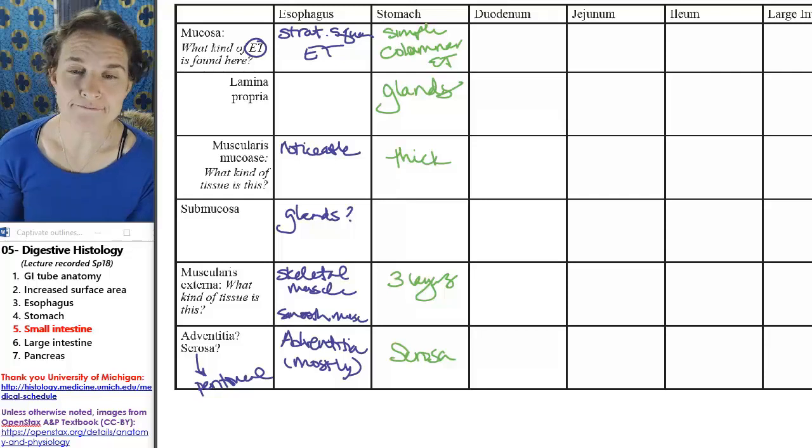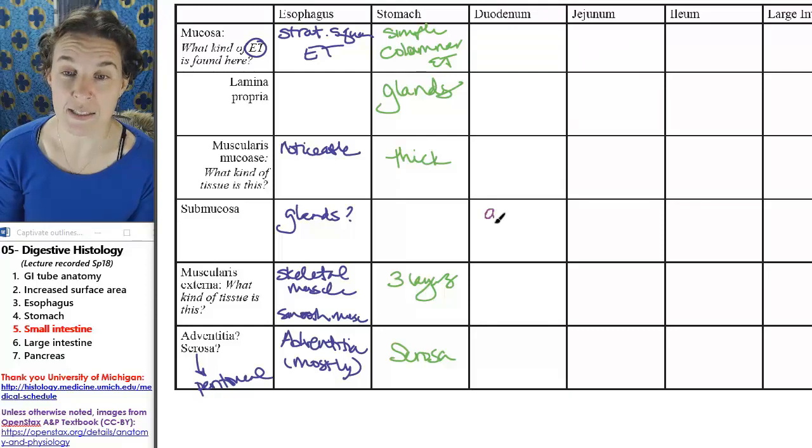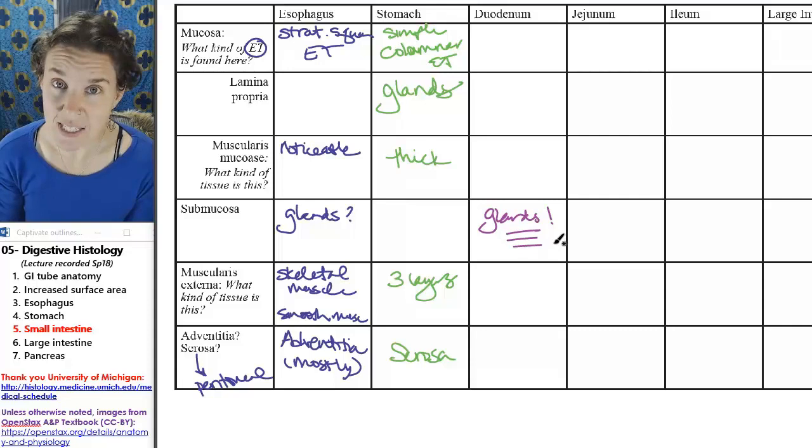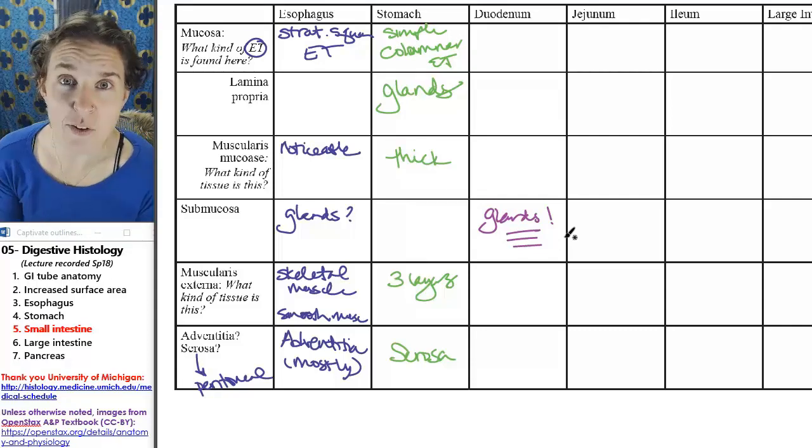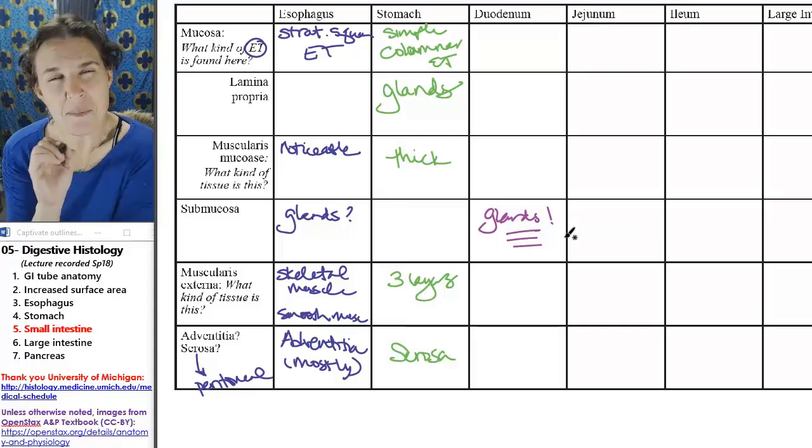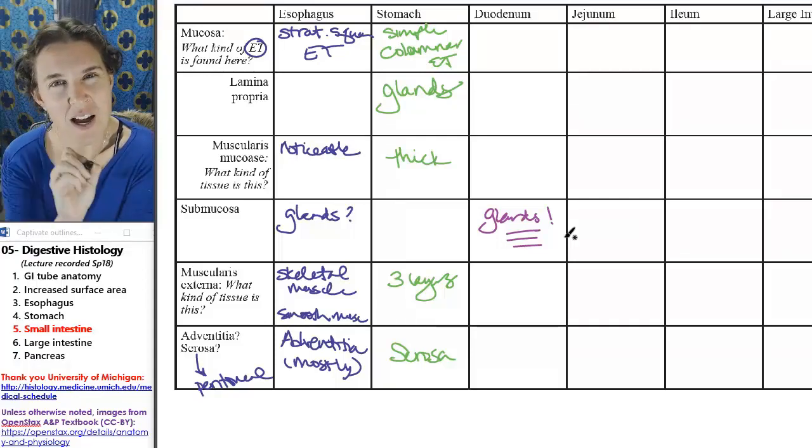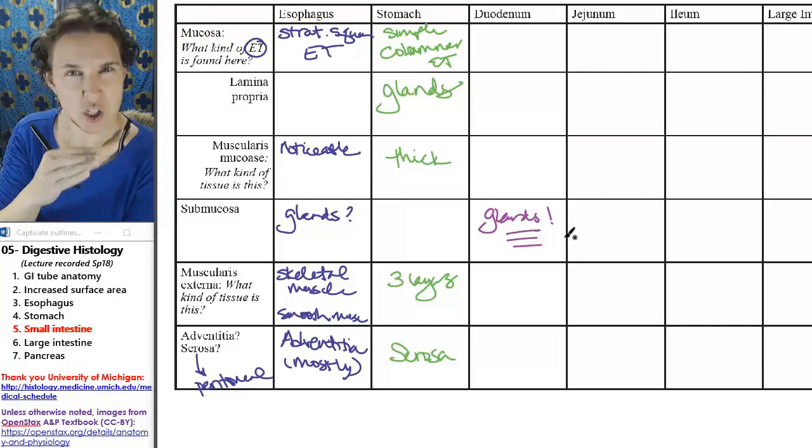The duodenum has an unbelievable number of glands—like crazy glands everywhere in the submucosa. And what that means is that you're going to have to identify muscularis mucosae in order to be sure that you are actually in the submucosa looking at all those glands.